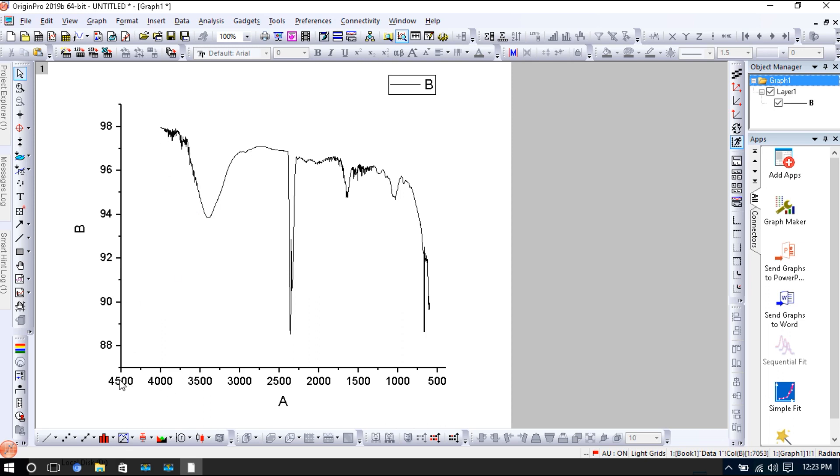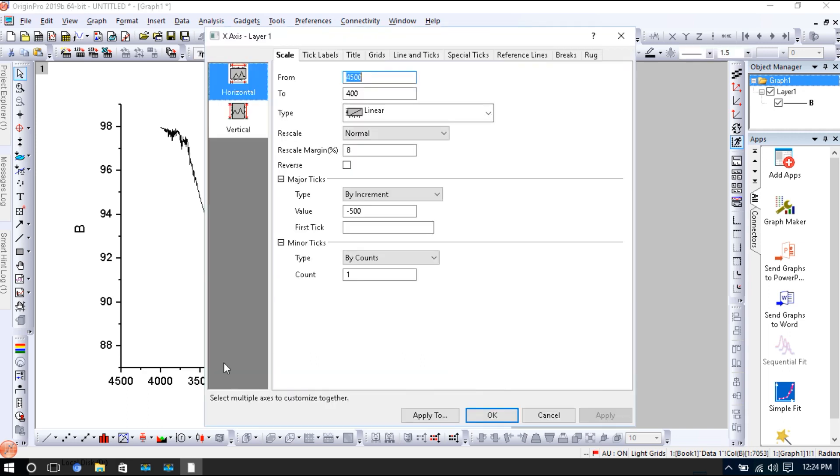4,500 is here and now 500 is here. But if you remember, we have told in FTIR that it should be from 4,000 to 400, so we will adjust it again. We will take it from 4,000 to 400, OK.